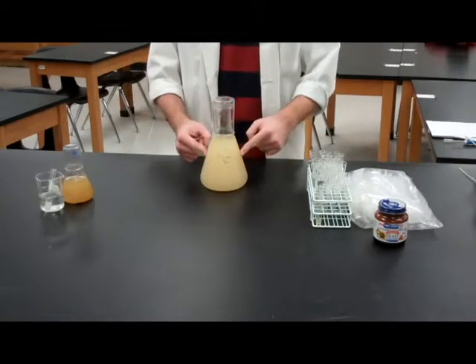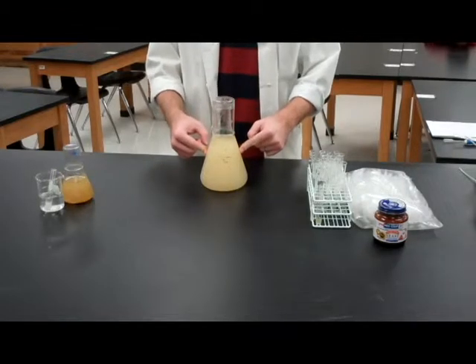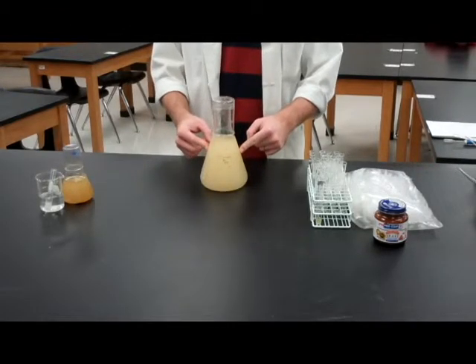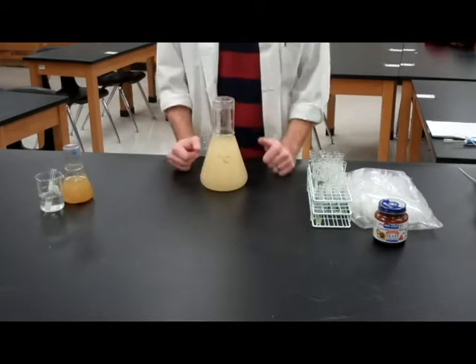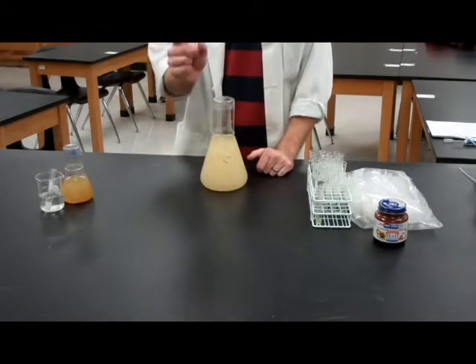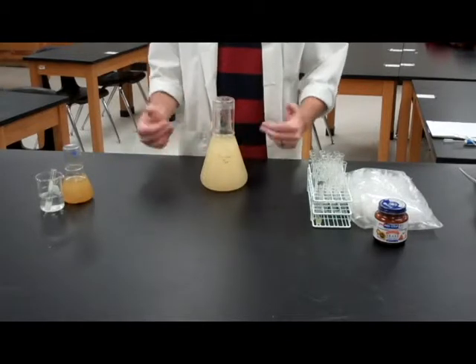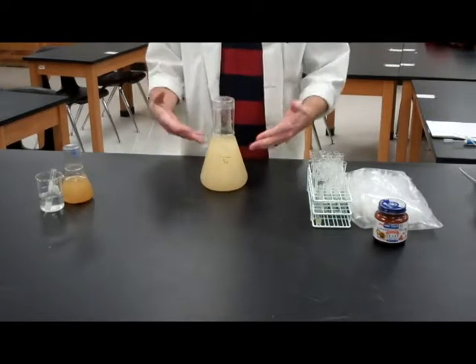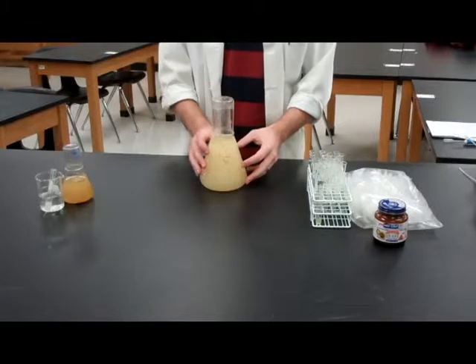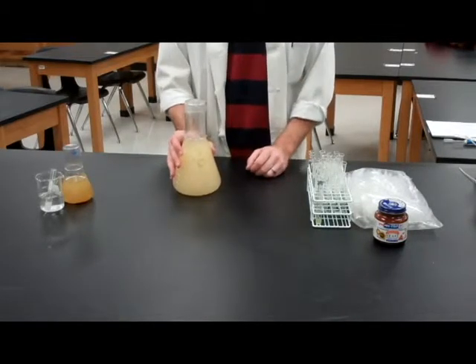You make YPD broth by adding 10 grams of yeast extract, 20 grams of peptone like casein hydrolyzed, you need short amino acid chains as their nitrogen source, and 20 grams of sugar like dextrose or glucose. Add all that into one liter of water and mix, and you have YPD broth.